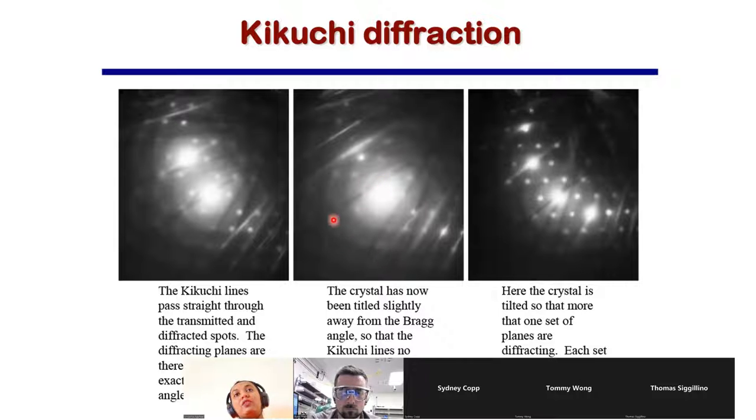So you will have to go to a condition. A lot of people, when you show them this diffraction pattern, would say you are very near to the zone axis. So you will literally have to move your sample so that you become immediately under the zone axis.